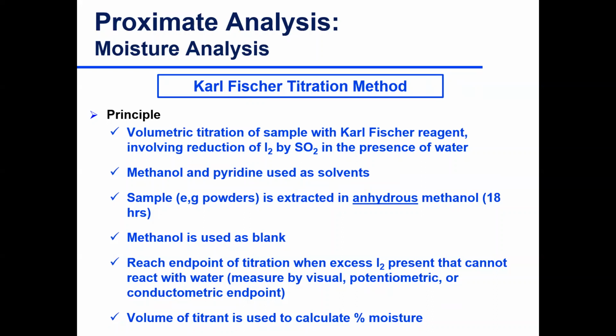solvent, stopper it, and then you allow it to extract, perhaps up to 18 hours. So that might be something you do overnight for that matter. You put your dry, semi-dry product in there. We use it very broadly for encapsulated foods and powdered ingredients that are going to the food industry. So basically the anhydrous methanol picks up that water.